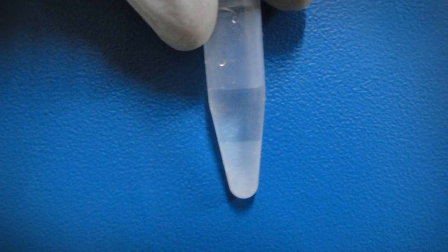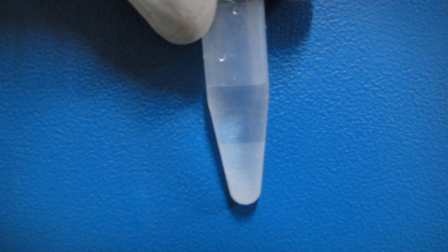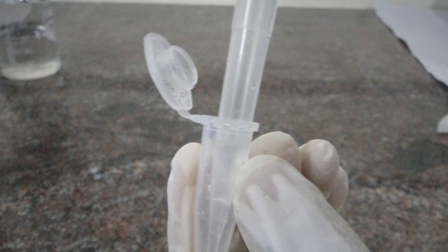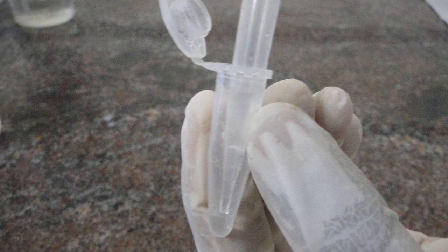We can observe two layers in the tube, a bottom organic and a top aqueous layer. Separate the aqueous layer to a fresh vial without disturbing the bottom layer.